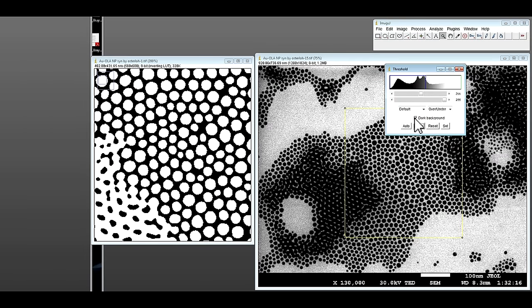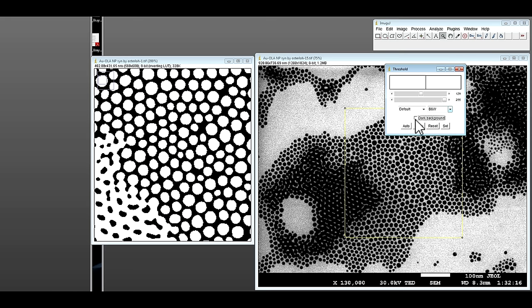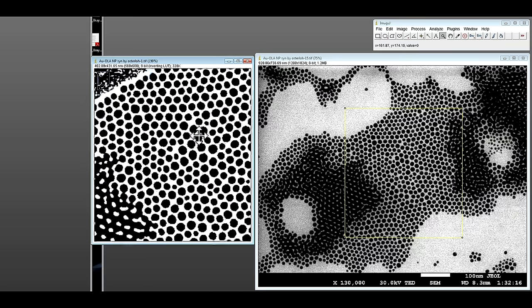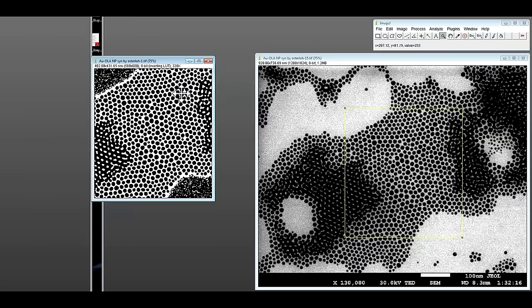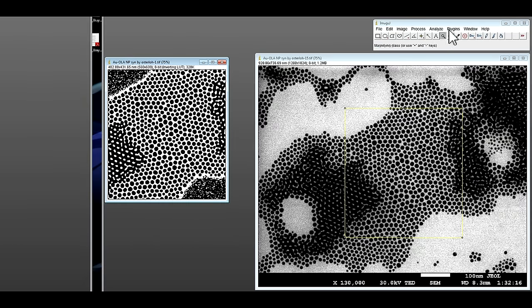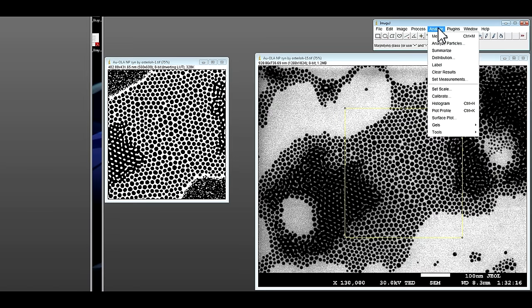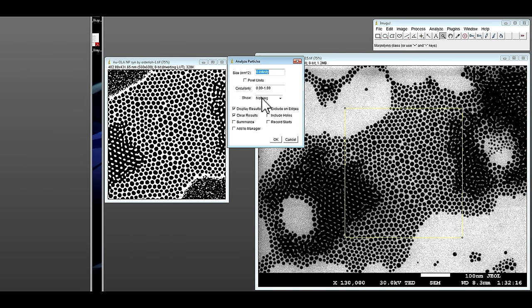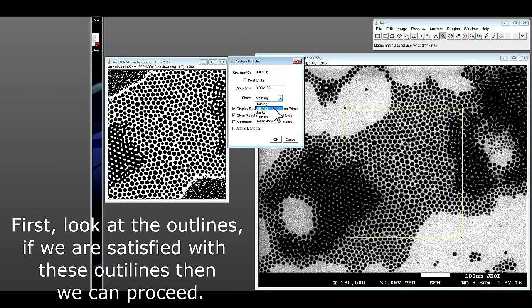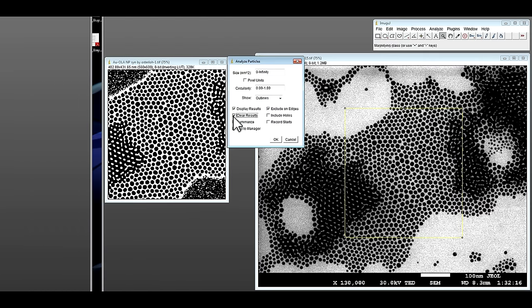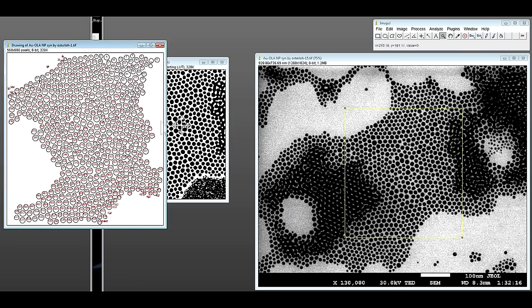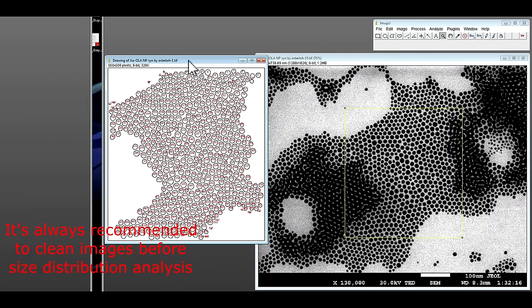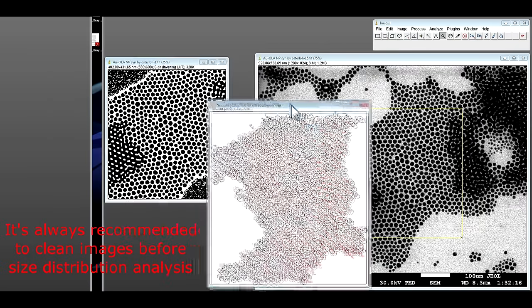And then you can analyze particles. In the beginning, you can just locate the outlines only. So you can see some small particles are over at edges, they are basically noise.